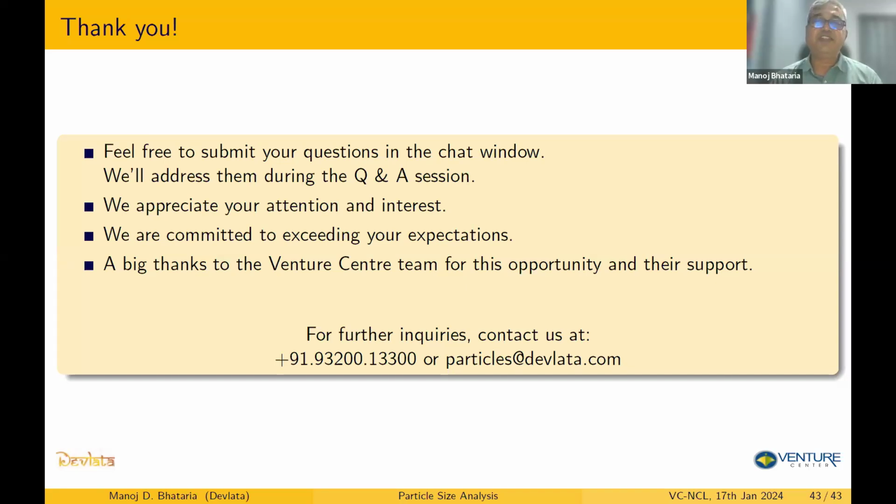So it really depends on the choice of the technique that you're using, the sample preparation that you're doing, and what your interest is. Many times you see evidence of nanoparticles using TEM or SEM. You see that your sample has smaller sizes, because in that analysis they narrow down to the area where you have nanoparticles, and it will show that nanoparticles are present.